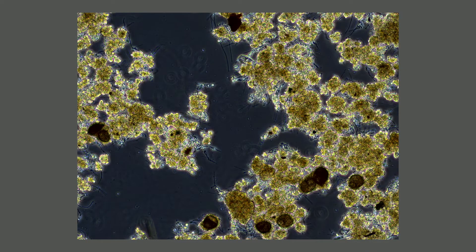Within the bioreactor however, the conditions were nearly perfect, with a balanced population of microorganisms and a rapidly settling activated sludge comprised of compact strong flocks.